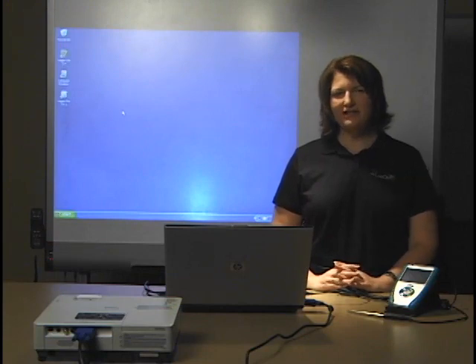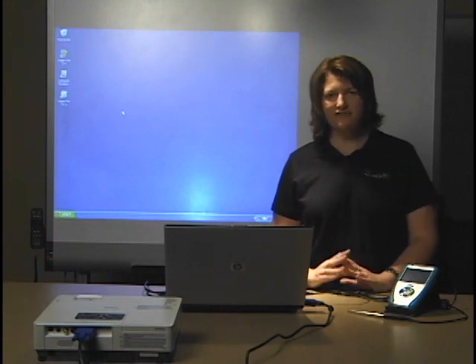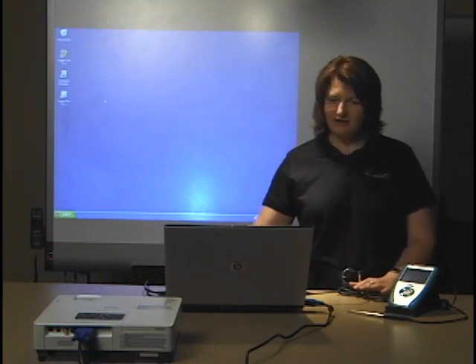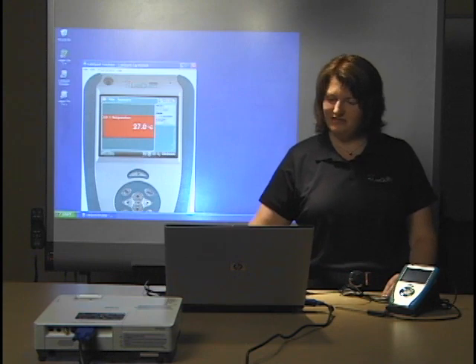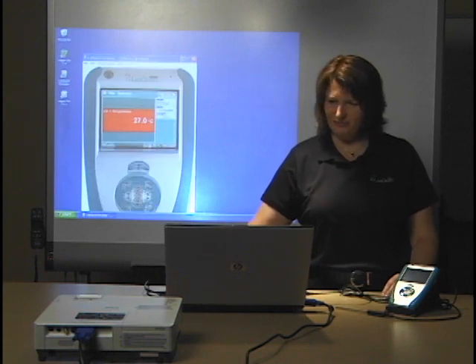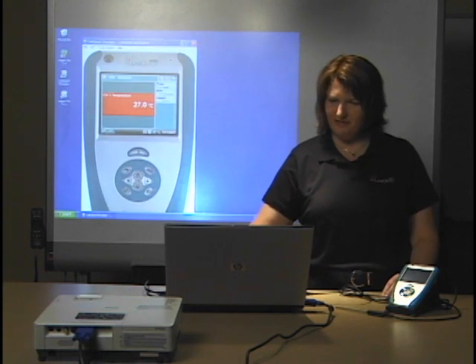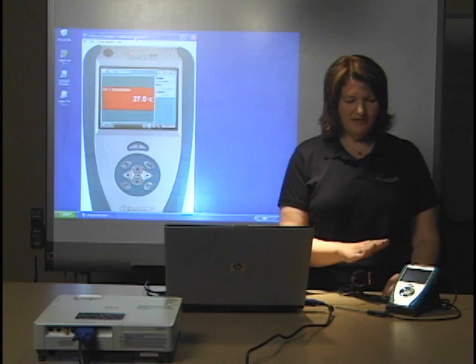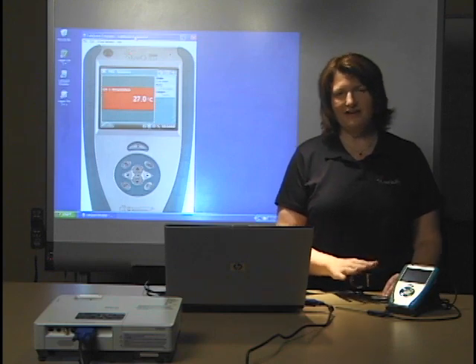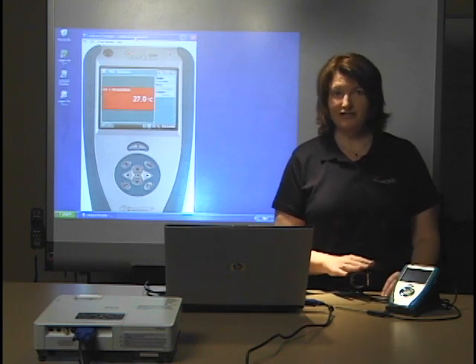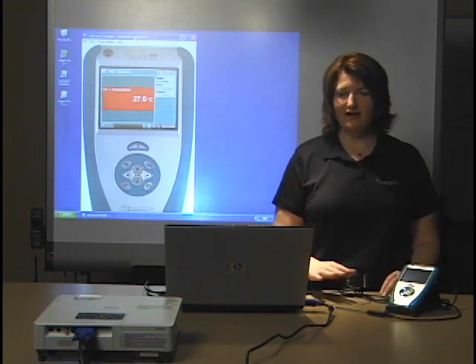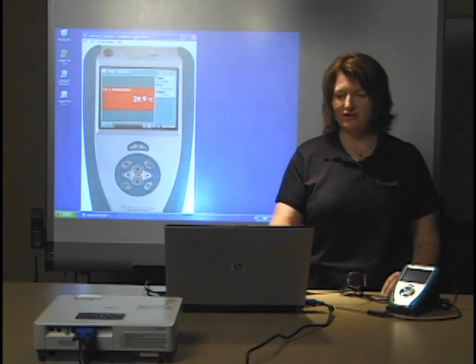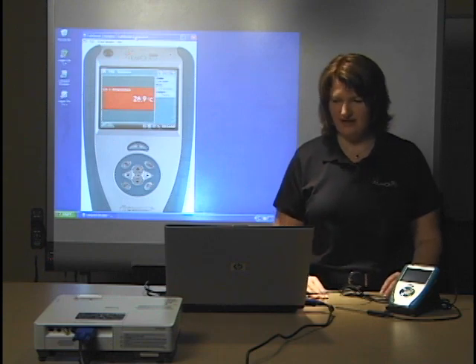The LabQuest emulator software lives on the computer — I'll launch it now. The software has been launched. You'll see that the LabQuest unit itself has the computer connection screen, and the computer emulator software is showing the live screen of the LabQuest.